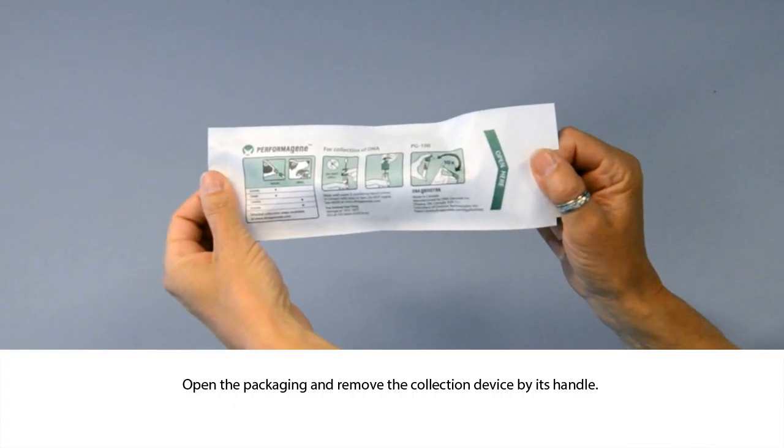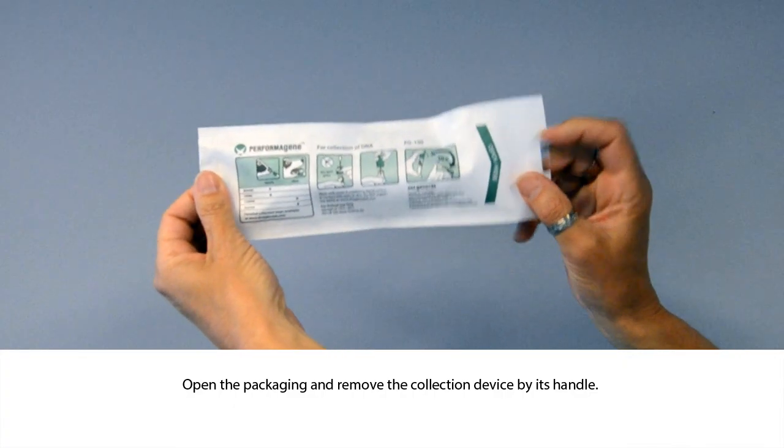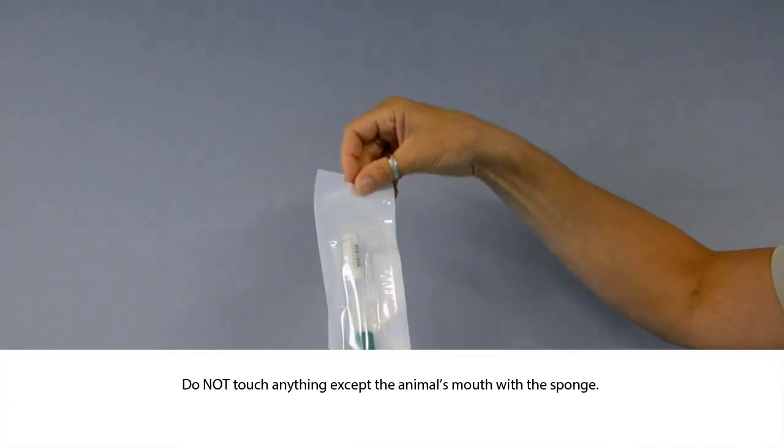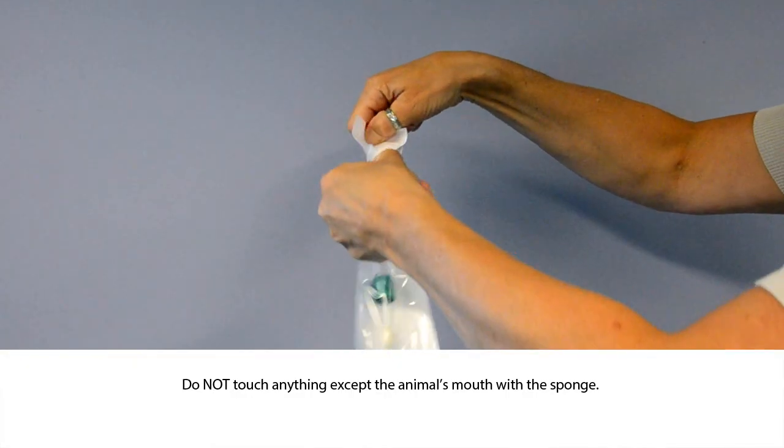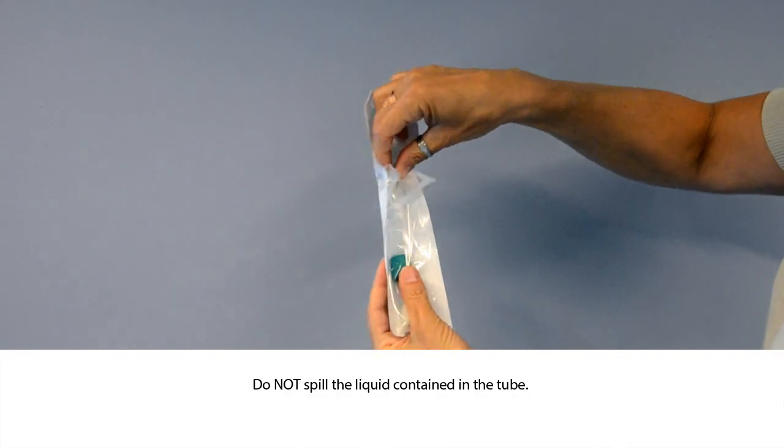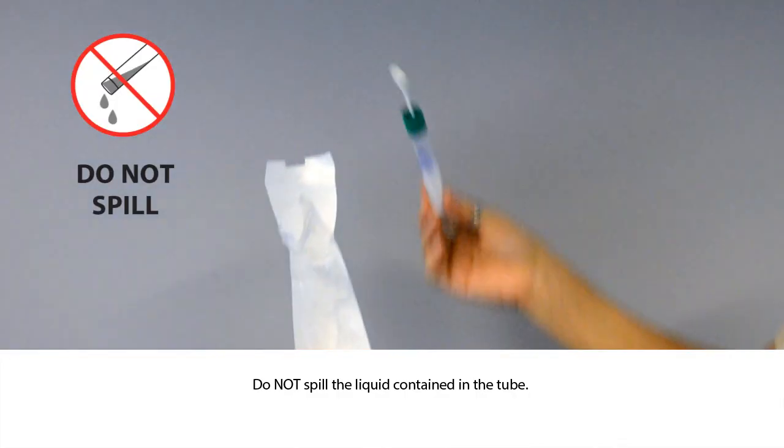Open the packaging and remove the collection device by its handle. To prevent contamination of the sample, ensure that the collection sponge does not touch anything besides the animal's mouth. Do not drop the collection device nor spill the liquid contained in the collection tube.